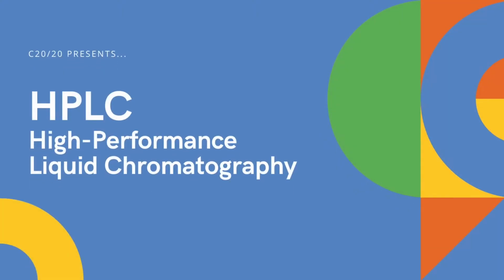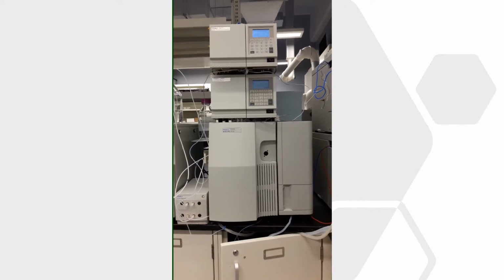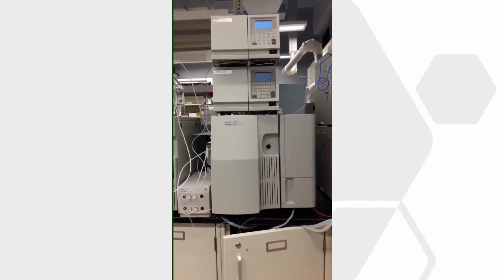I'm going to take you through one of our most important instruments, a basic setup in any drug delivery lab, which is HPLC, standing for High Performance Liquid Chromatography, and which we use for analyzing drug concentrations in our samples. So HPLC is the process of separating components in a liquid mixture.